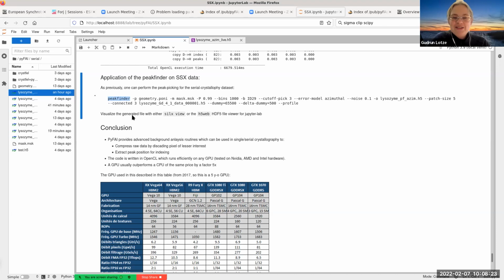And now here's the tricky thing, because I do 2D scanning X-ray diffraction. Will this work too, do you think? Yeah, it should work, because it will spit out all the diffraction patterns or numbers where the same crystal was observed. So it doesn't care if the images were one after another. Okay, and in case I'm missing rotation, because I only scan perpendicular through the image, I cannot rotate.